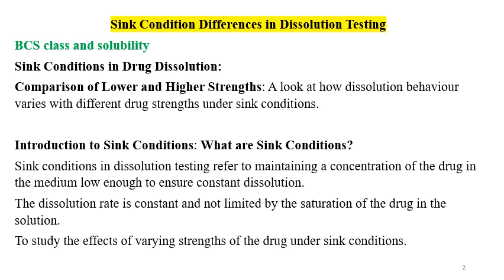Sink condition is maintained when the dissolution volume is such that it can dissolve at least 3 times the dose of the strength being studied.